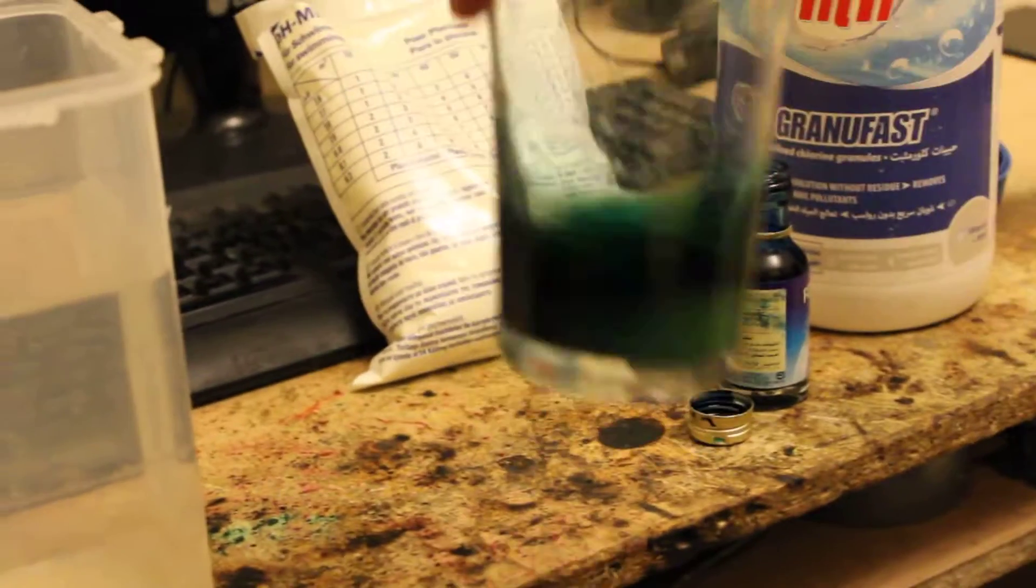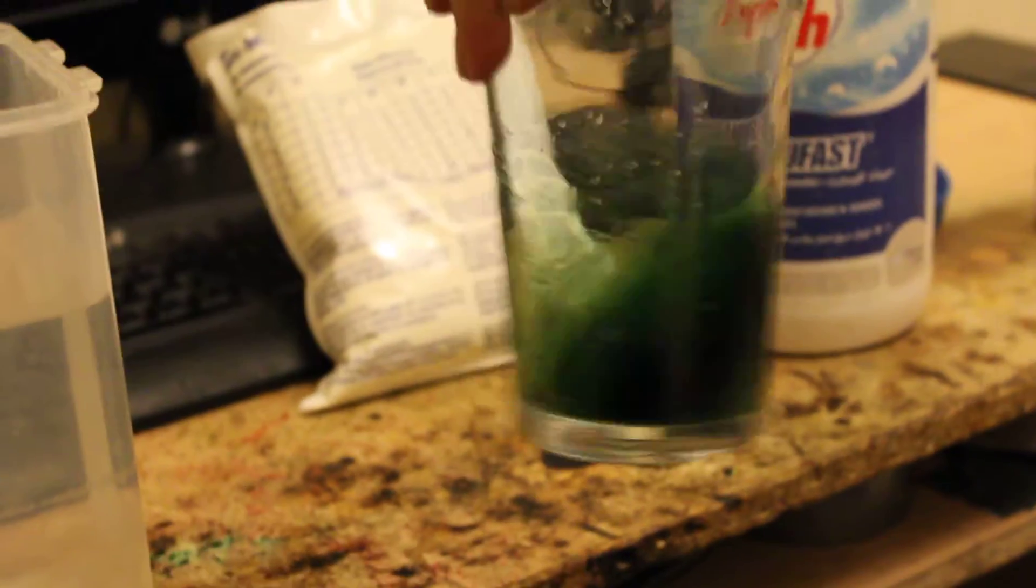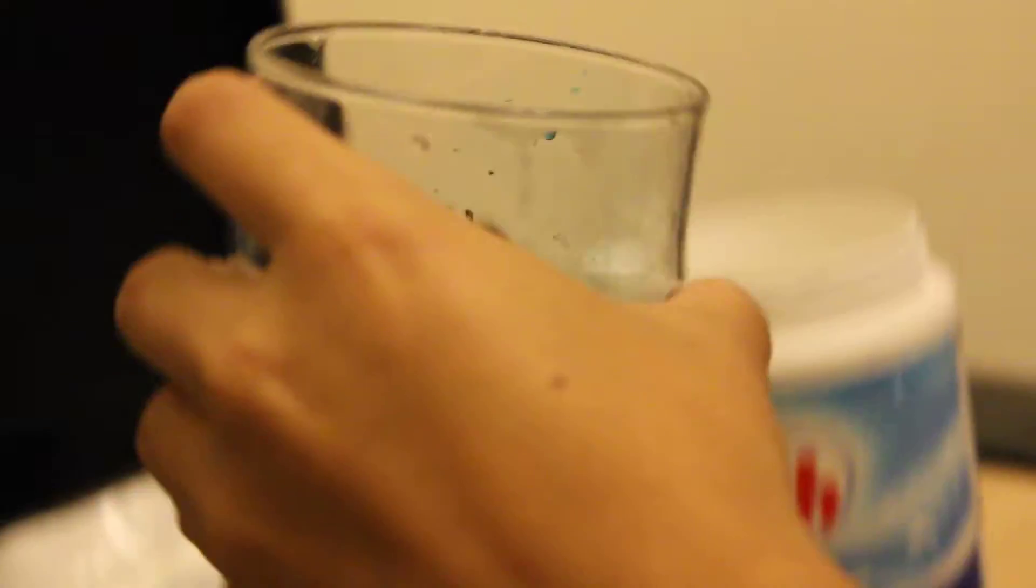Then you have to swish it around and the solution should turn green. This means your indicator is now active. Once you see this color change, it should turn like a little leafy green with a slight tinge of yellow. This means your indicator solution is now activated.